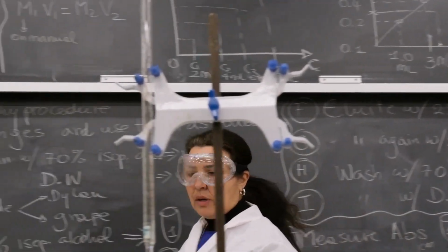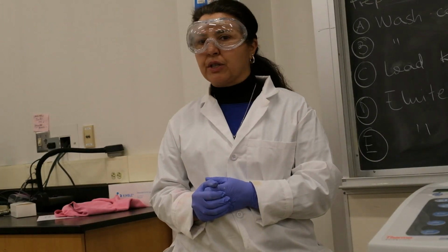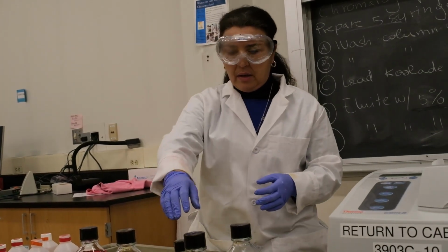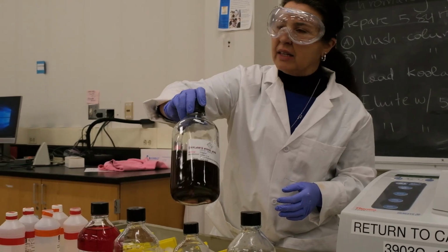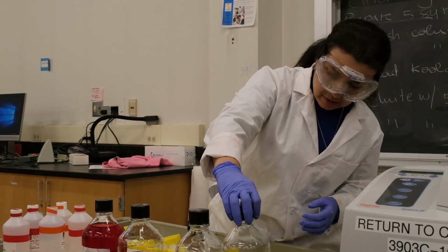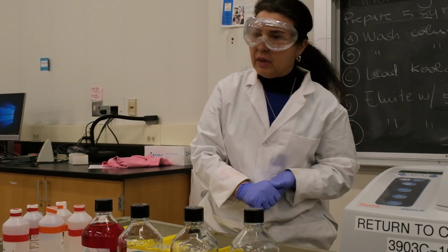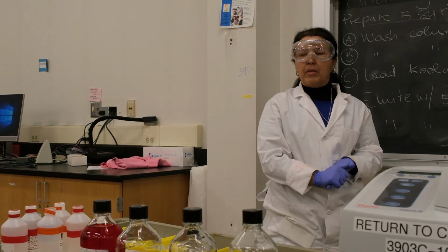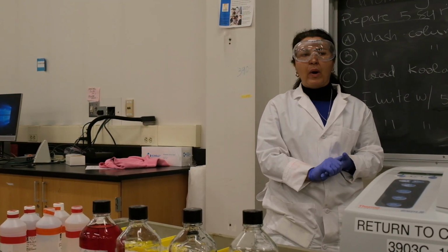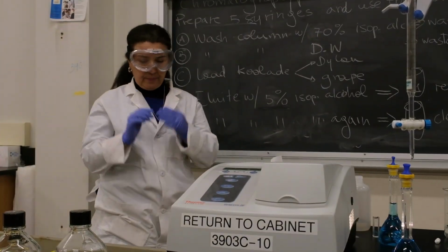And then you're going to do the separation and the determination of the concentration of the two dyes in that mixture, either the grape and the Dylan mixture. Okay? Any questions? No questions? Okay.